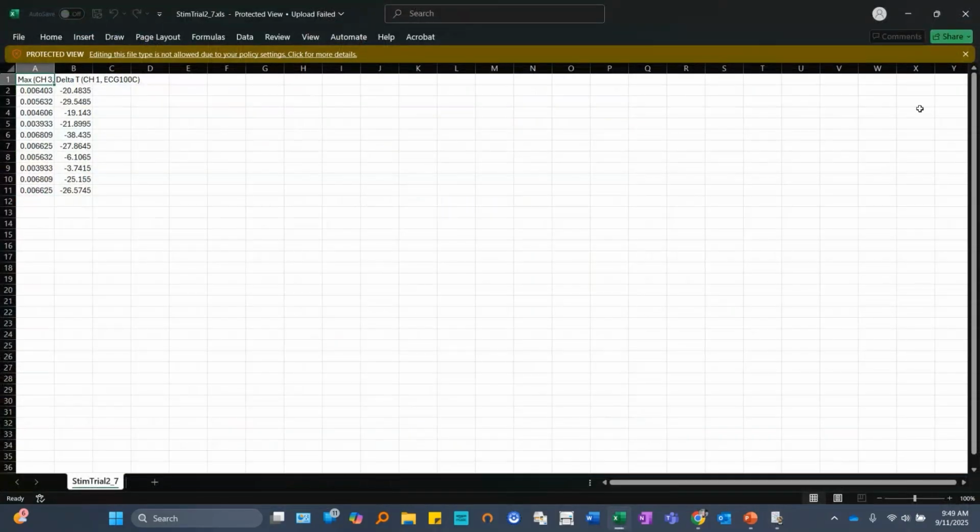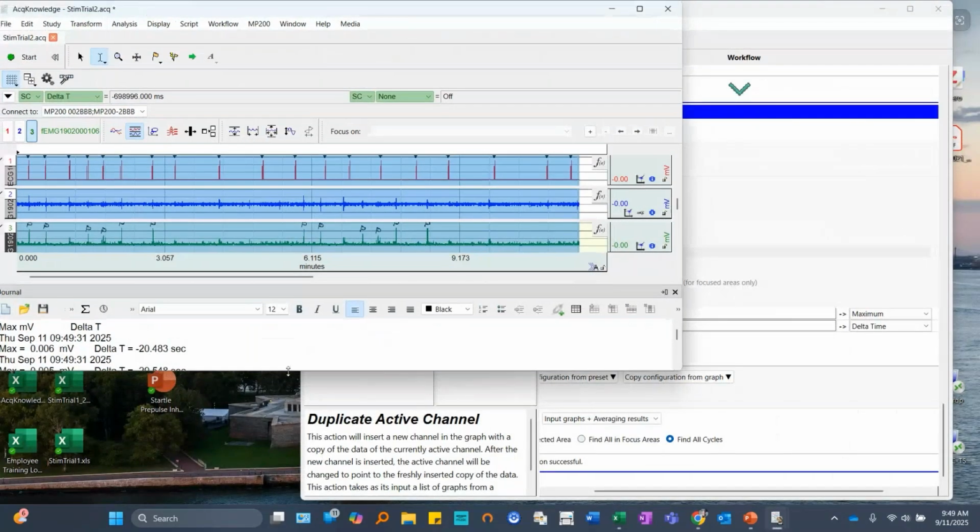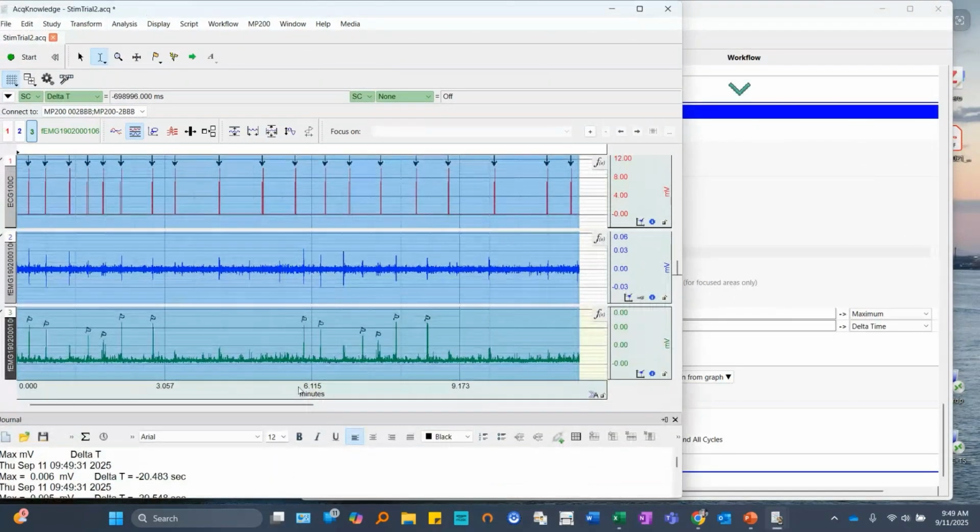So you can see just once you've put the time into building the workflow, you can see how much time that can ultimately save. And of course, once data is in AcqKnowledge, once data is in Excel, that's where you can do further analysis, in terms of averages and comparisons, and basically prep the data for more higher level statistics.